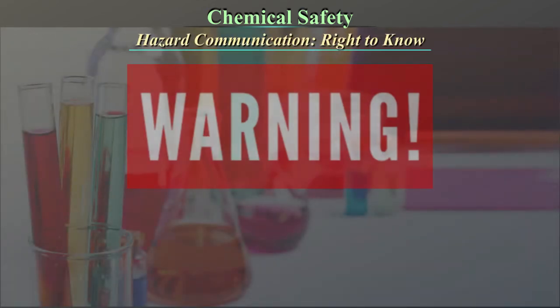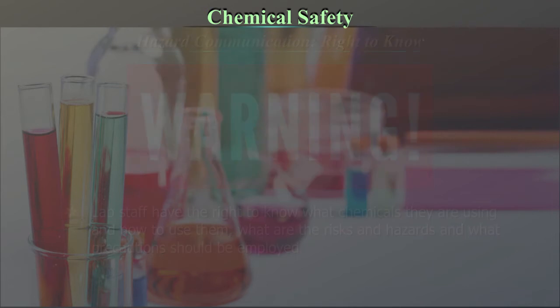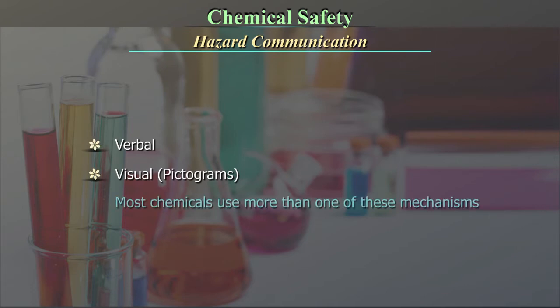This is an important chapter in the lab safety manual which has to be read and understood completely. Hazard communication — Right to Know: The lab staff have the right to know what chemicals they are using, how to use them, what the risks and hazards are, and what precautions should be employed. All these are adequately indicated through several mechanisms like verbal, visual, and pictograms. Most chemicals employ more than one of these mechanisms.